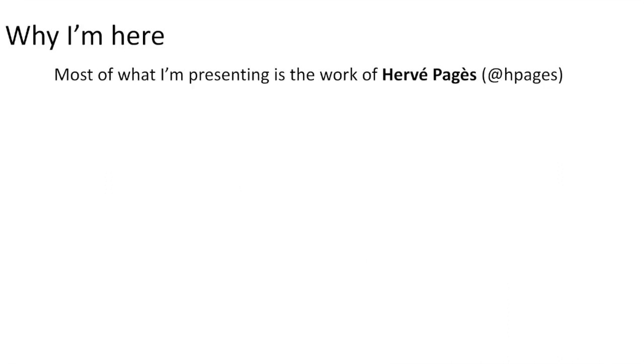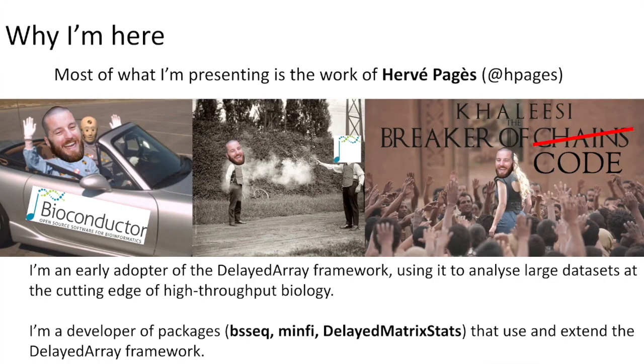The delayed array framework is led by Hervé Pages, one of the Bioconductor core team members. The reason I'm here today presenting this workshop is that I have been an early adopter of the delayed array framework, using it to analyse large datasets at the cutting edge of high-throughput biology. So I see myself as a bit of a crash test dummy for the delayed array package. I'm also a developer of packages that use and extend the delayed array framework, in particular those for analysing DNA methylation data.